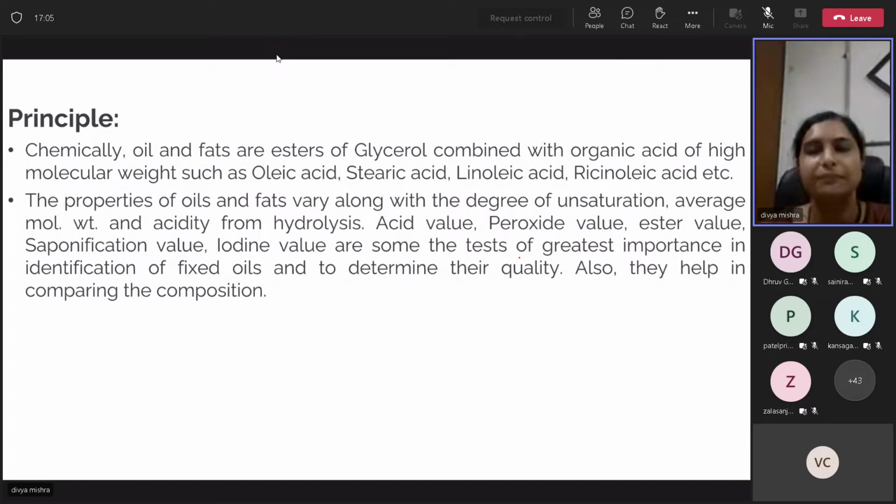जैसे अगर मैंने कहा कि ये वेजिटेबल ऑयल है, तो वो मुझे कैसे पता चलेगा? तो उसका कुछ प्रॉपर्टीज होगा कि जिसका वैल्यू वही आएगा, जैसे एसिड वैल्यू, सपोनिफिकेशन वैल्यू। इसलिए ये बेसिक प्रॉपर्टीज है जिसको हम फाइंड आउट करेंगे यहाँ पे। ओके, सो दीज प्रॉपर्टीज हेल्प्स अस इन कंपेयरिंग द कंपोजिशन ऑफ वेरियस फैट्स एंड ऑयल्स टुगेदर and helps us to differentiate them, helps us to identify.